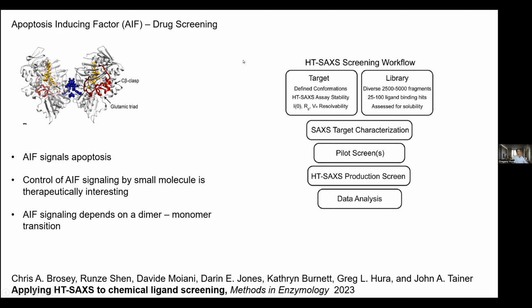All right, and so the workflow, as I mentioned, 7,000 samples or 10,000 small molecules would be very difficult. It would take more protein than you'd want. So there's some triaging going on. One is in the library that they're using. They're using a smaller library, handpicked for being a druggable target, small, cell permeable, etc. So there's some criteria there.